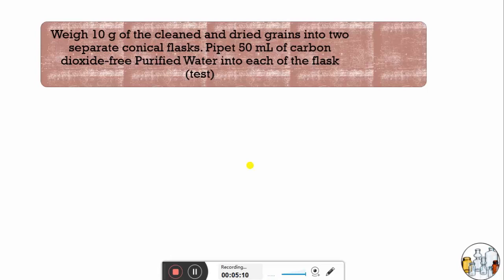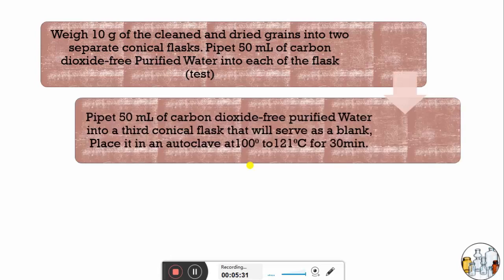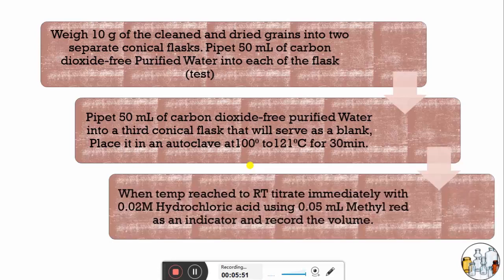With the grains completely cleaned and dry, take 10 grams of powder in two separate conical flasks and add 50 ml of carbon dioxide-free purified water to each flask. These will serve as the test solutions. In a third conical flask, pour 50 ml of carbon dioxide-free purified water to serve as a blank. Place all three conical flasks in an autoclave at 100°C to 121°C for 30 minutes.